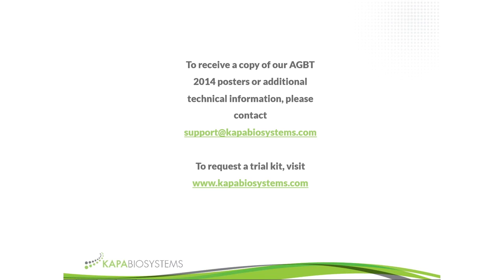Most of these methods for Hyper Prep will probably be available in the next 6 to 8 weeks. So we're looking at sort of June, July timeframe for the first set of platforms, and then we'll continue to develop after that. Excellent. So are you using KAPA Hi-Fi Uracil Plus for FFPE samples?